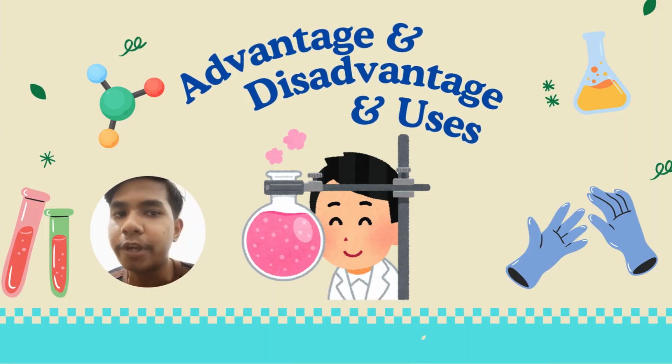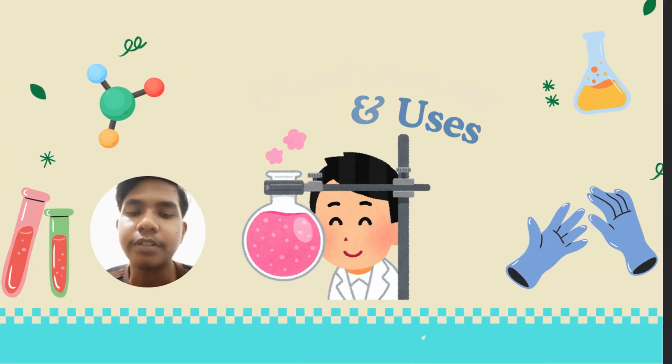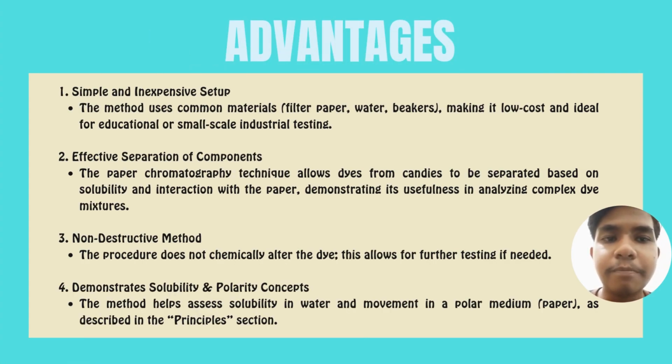Next, we move to advantages, disadvantages, and use. Advantages. First, simple and inexpensive setup. The method uses common materials, filter paper, water, and a beaker, making it low cost and ideal for educational or small-scale industrial testing. Second, effective separation of components. The paper chromatography technique allows dye from candy to be separated based on solubility and interaction with the paper, demonstrating its usefulness in analyzing complex dye mixtures.